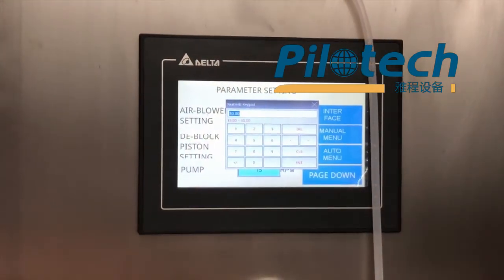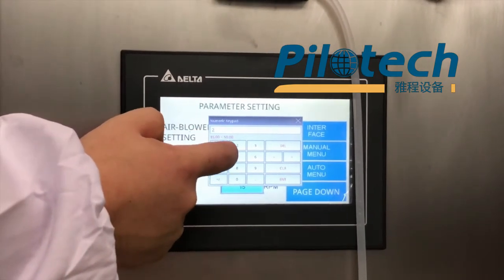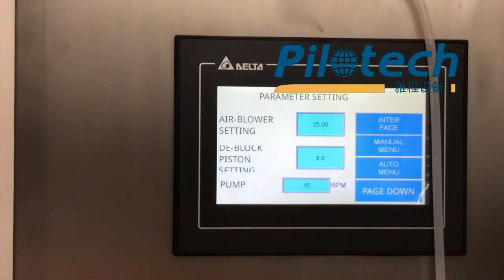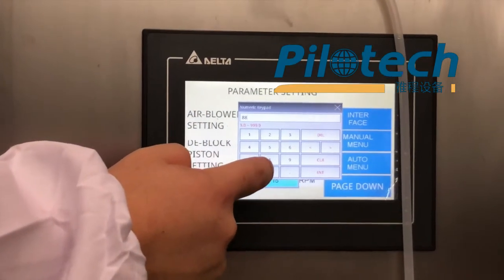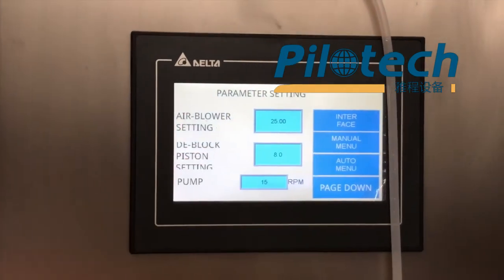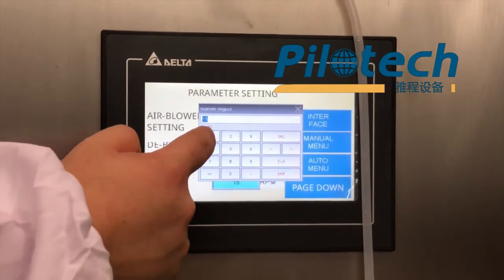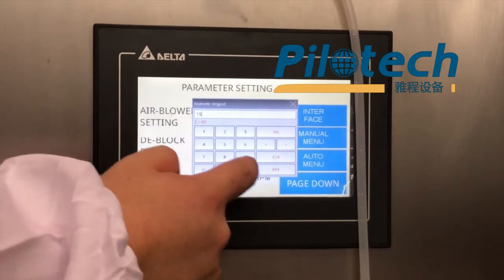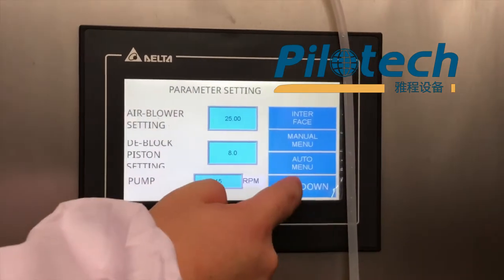Air blower setting at 25. De-block piston setting at 8. Pump setting at 15. Page down.